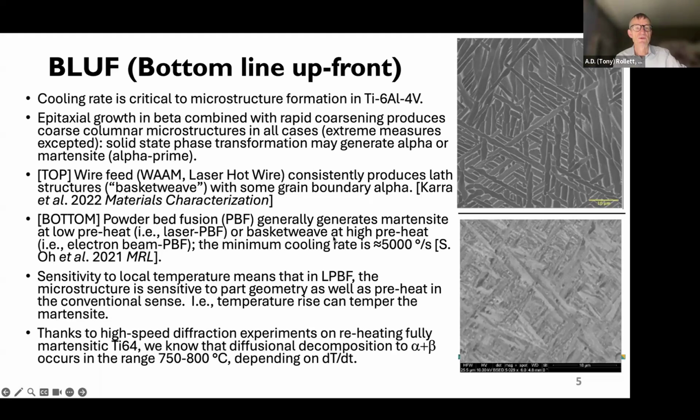However, if you do laser powder bed fusion and you don't take the material up to a high temperature afterwards, then you do get a martensitic structure. It's not necessarily pure, so to speak, martensite. In fact, this micrograph has hints of the beginnings of tempering or decomposition. So I'll tell you a little bit about that.